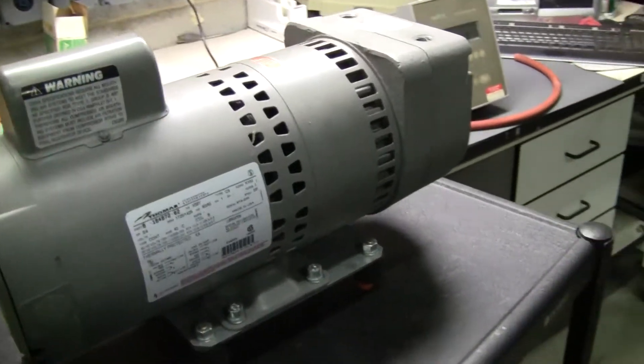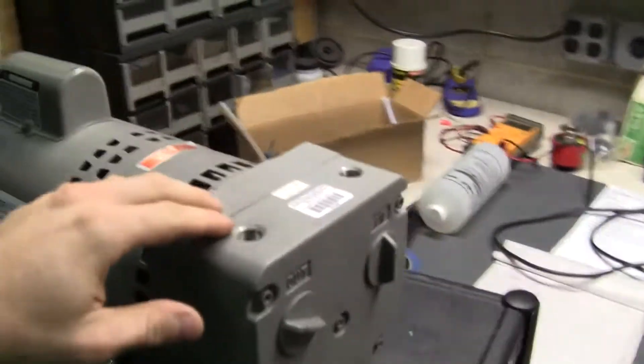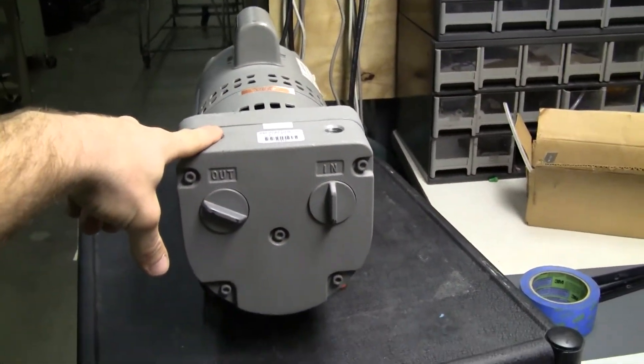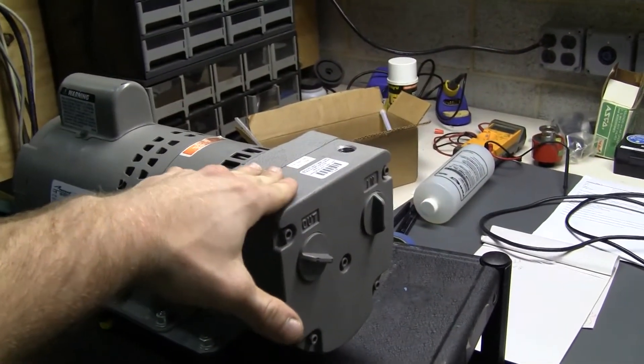Just turn it on here. This pump has no fittings on it. It's being sold as-is — it's used. If you put a filter up here, you would cut down on the noise.